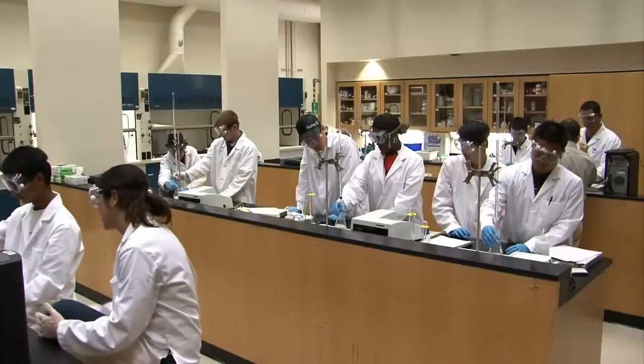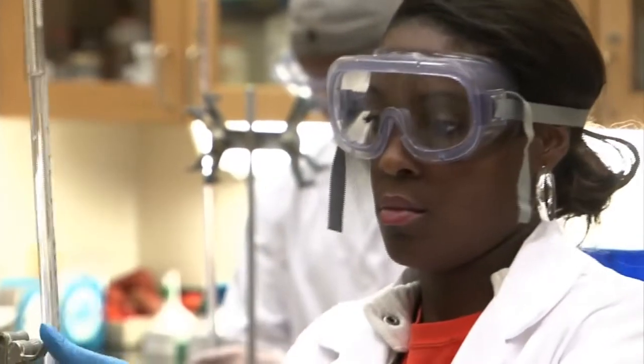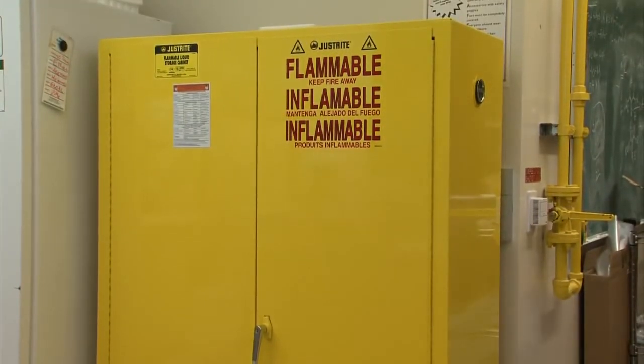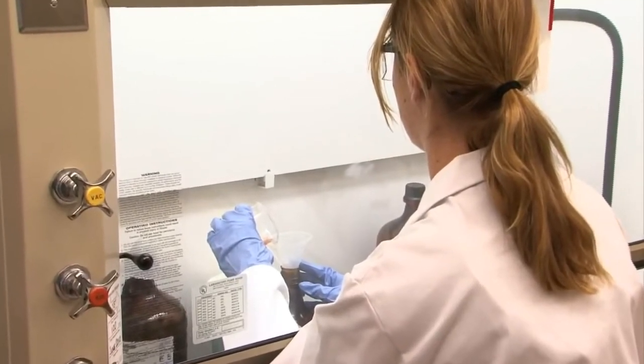There are various methods of protecting yourself in the lab. Look for postings that inform you of certain dangers. Each lab is equipped with engineering controls such as flammable cabinets for chemical storage and fume hoods to vent noxious fumes away from you while you are working.